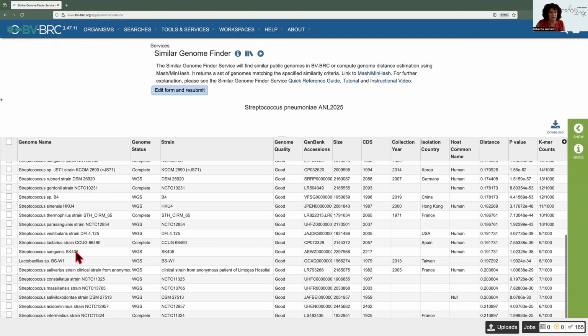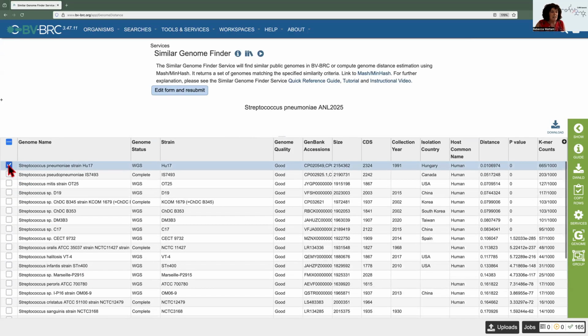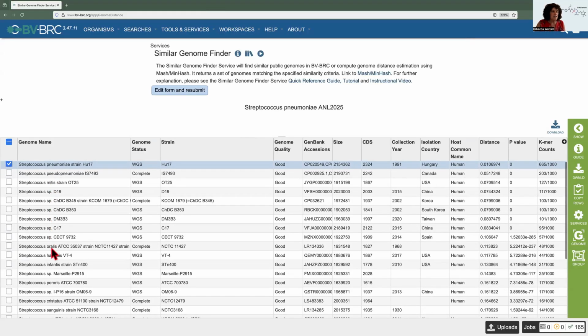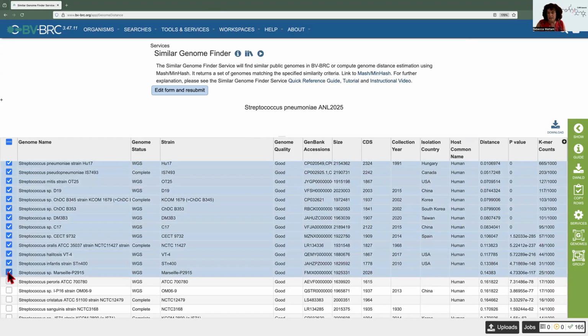Well, you know, when I see something like that and I see it surrounded by strep, I wonder about that genome. But let's, just for fun, take the top 10. So I can click on that. 1, 2, 3, 4, 5, 6, 7, 8, 9, 10. Now let's take it all the way up to this 17. And then I can do a shift click, and I'm going to create a group of those. And we're going to use that to generate a tree later, because in your phylogenetic tree, if you can get some things that are slightly outside, it just looks nicer. It roots your tree better.